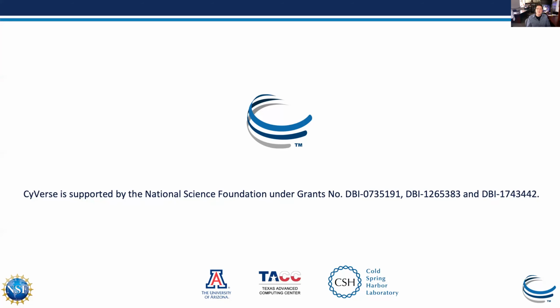There might be one since published, but at least as of 2017, that was the largest one, and it handled it like a breeze. There's a link on there if you want to run that on CyVerse. It's under the additional technical things, and you can see it run. So PatMatch is not limited in running on CyVerse, and it can handle huge genomes.